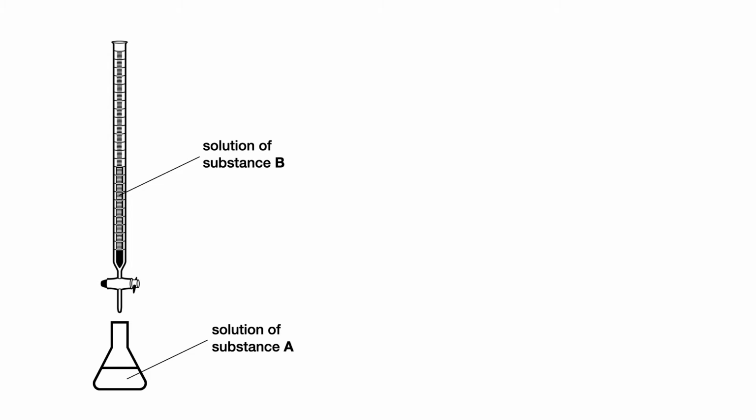There are a variety of reasons for this. One reason is simply that it's easier to precisely measure the added amount of a liquid than it is to slowly add solid and precisely keep track of how much you've got. And so you're very often adding one solution to another, and very often the end point of the reaction is not obvious by itself, as it was in the case of the reaction between the zinc and the copper sulfate.